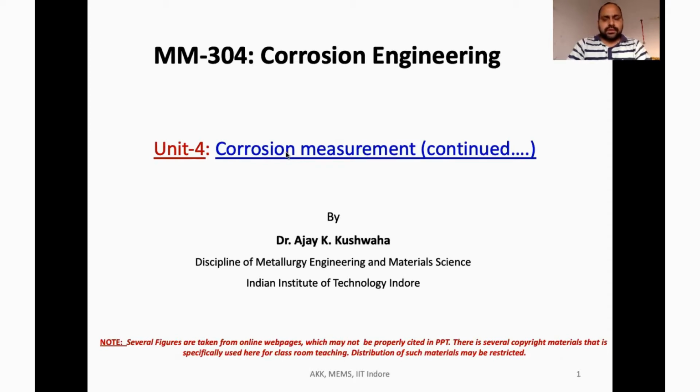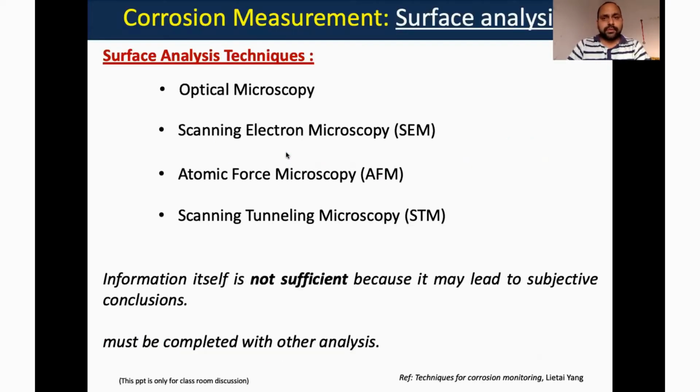Today we will switch to the new topic that we already introduced in the last discussion. This is basically surface analysis, the second approach, in which we may consider the following techniques: optical microscopy, scanning electron microscopy, atomic force microscopy, and sometimes we also use the scanning tunneling microscope.